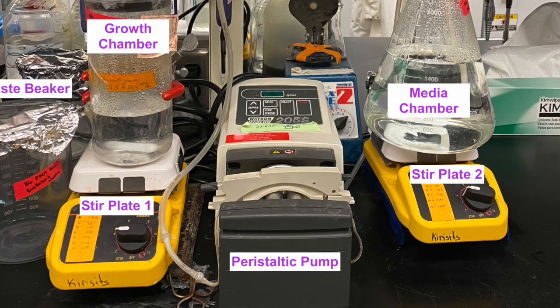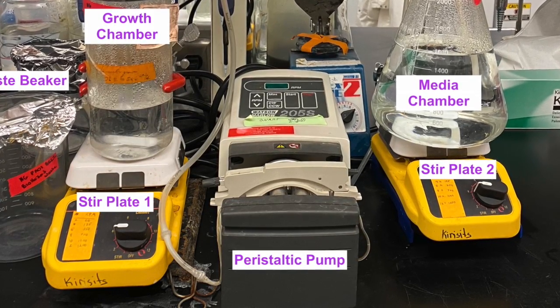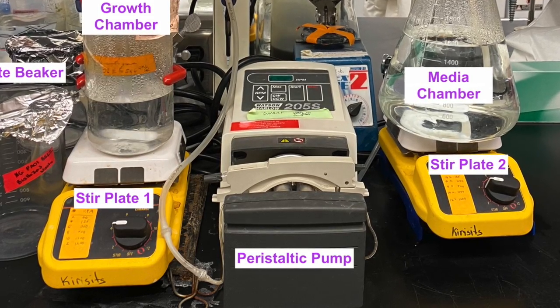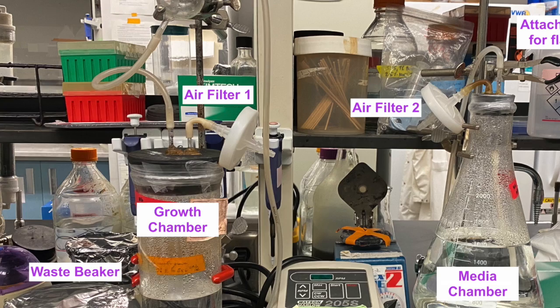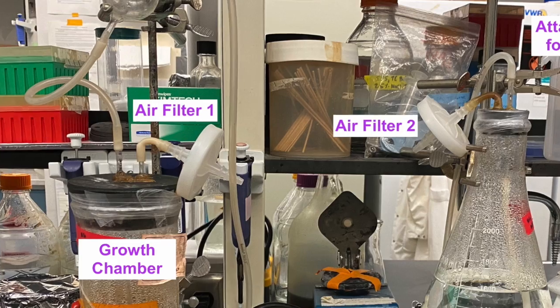A peristaltic pump is used to initiate flow from the media chamber into the growth chamber. We can control the direction, whether it's counterclockwise or clockwise flow, and we can control the speed of the flow with this pump. The air filter is connected to the tops of both the growth chamber and the media chamber.